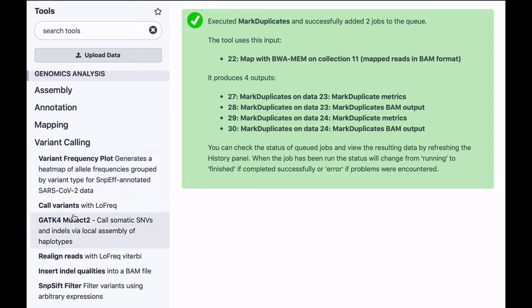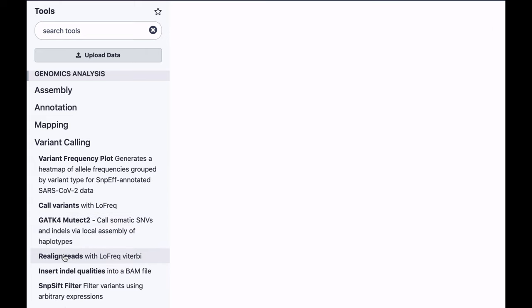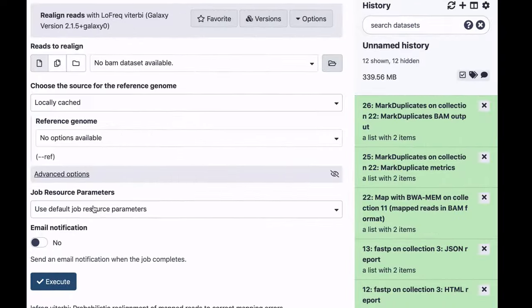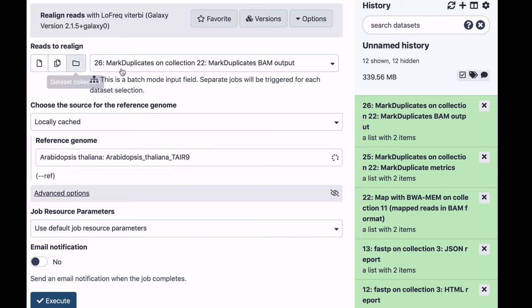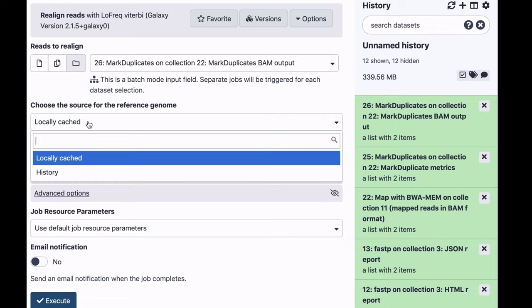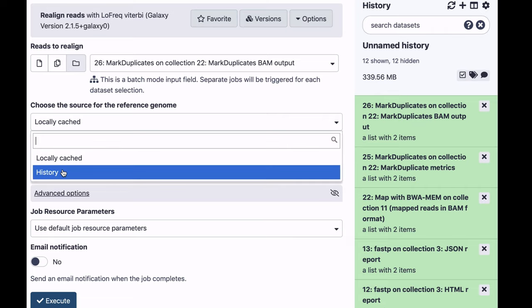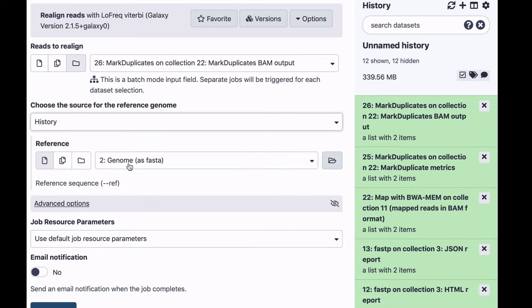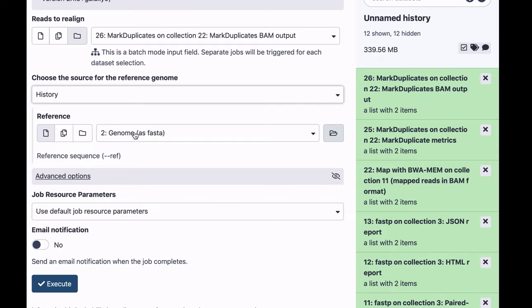We're going to scroll and find the variant calling section. LOFREQ is actually a collection of tools. So the first tool that we're going to be using is called realigned reads. It takes care of the indels, makes sure that the indels are inserted in a consistent way. Again, we're using collection, now the output of mark duplicates tool. It does require a reference, and that reference is in our history, so we're going to select this genome as FASTA to do this.